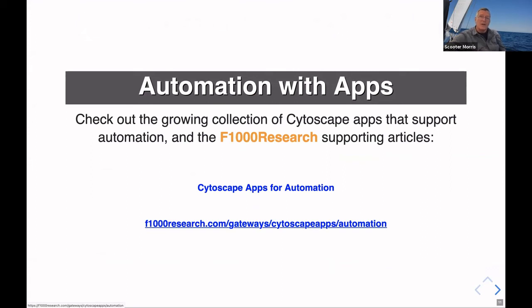So for example, as you'll see in the use case that we're going to go through, you can have R basically ask the string app in Cytoscape to load a network into Cytoscape, by sending commands to string and saying, load this network, taking advantage of these proteins. So this provides a lot of capability and opens up a wealth of apps to you without having to recode a lot of that stuff. And at the same time, you can take advantage of a lot of the capabilities that are within R and the R packages that are available.